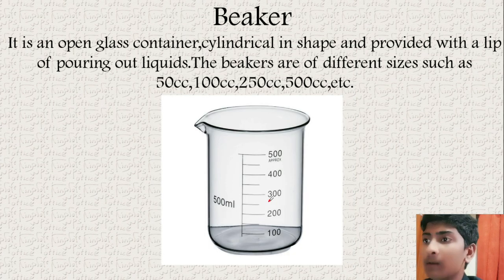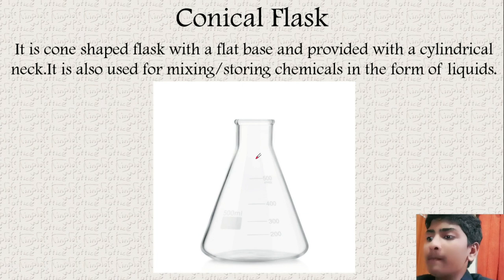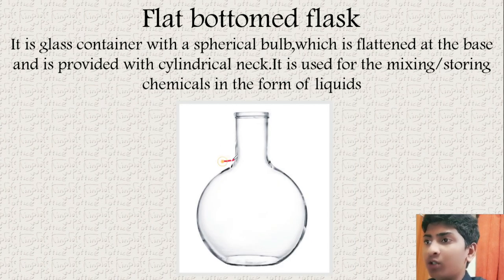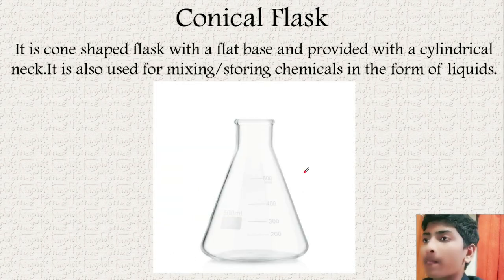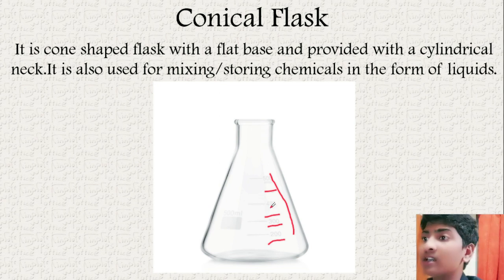Next, beaker. It's an open glass for mixing and storing chemicals in the form of liquid.